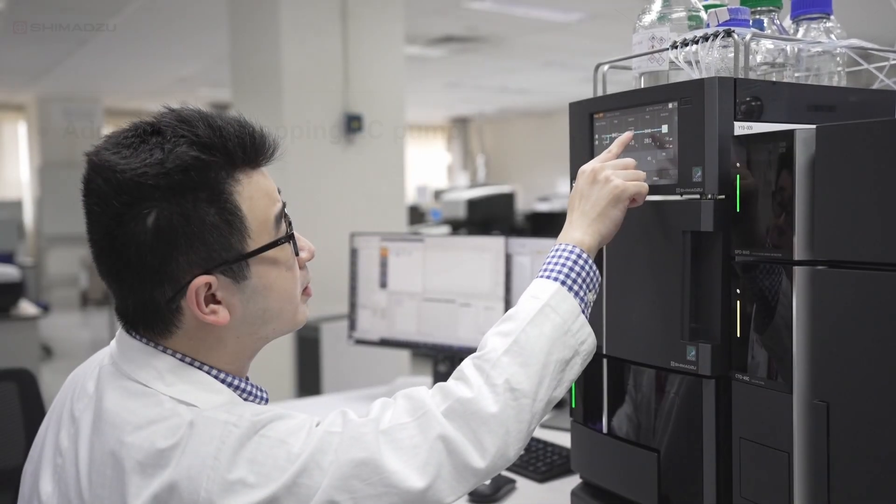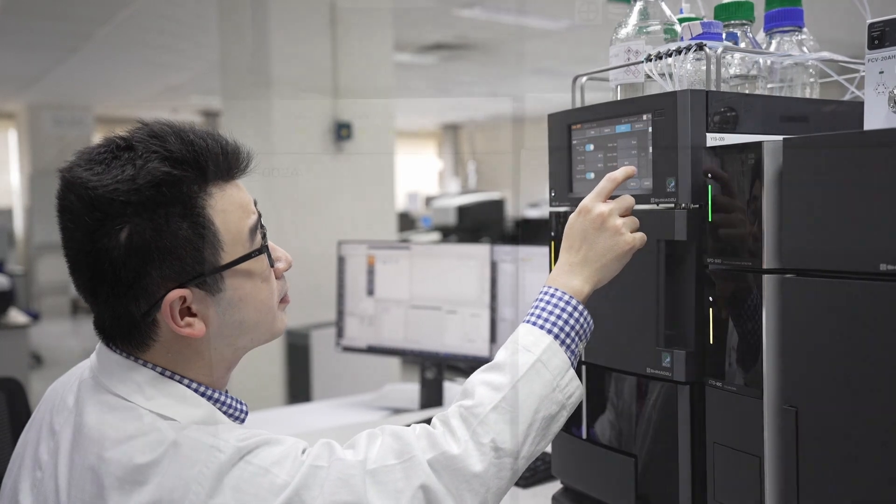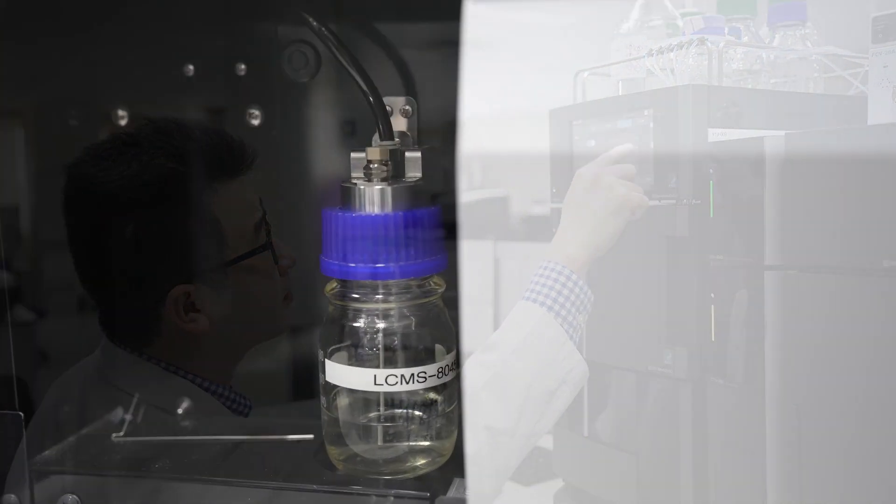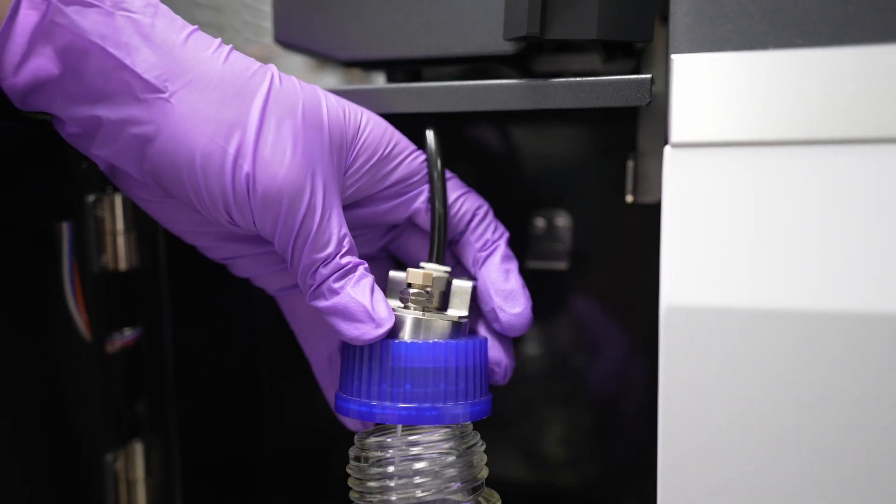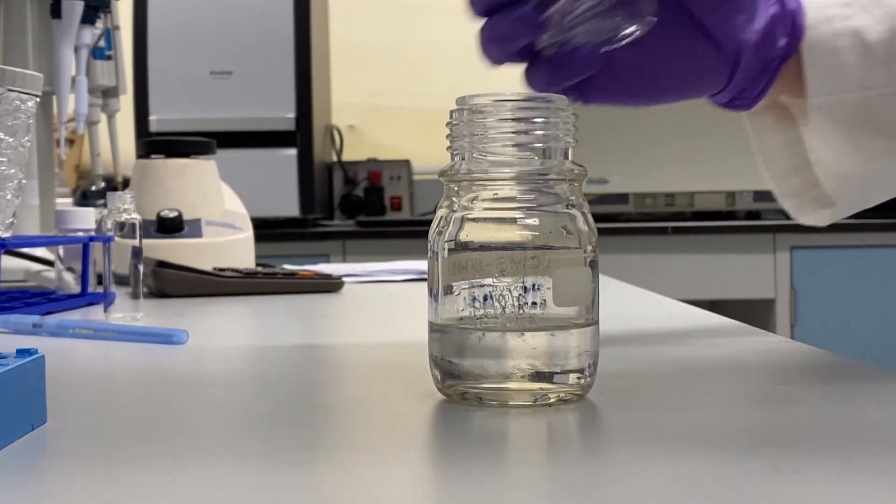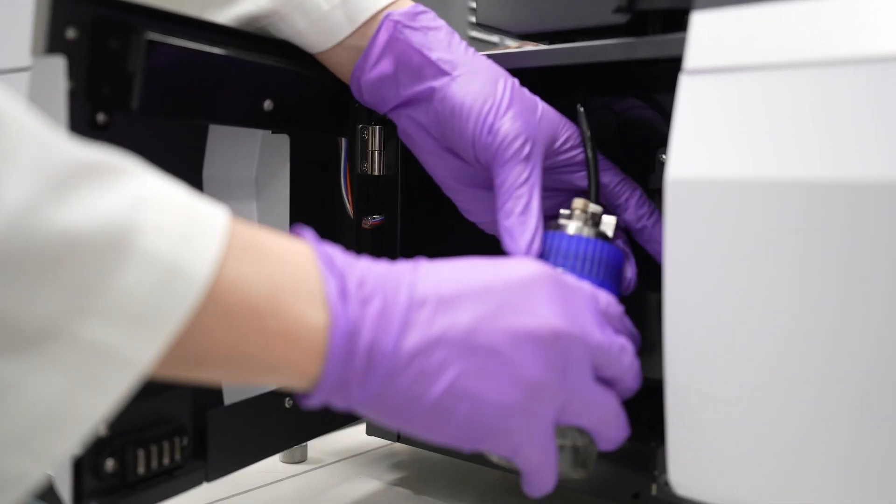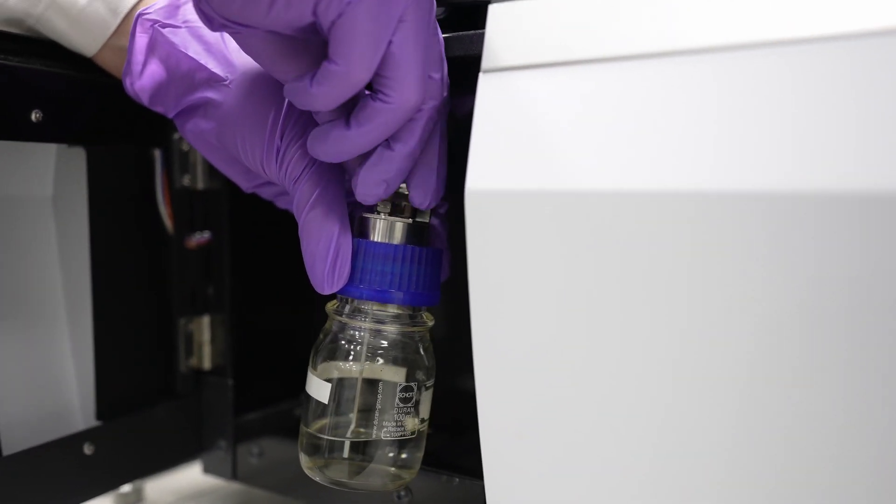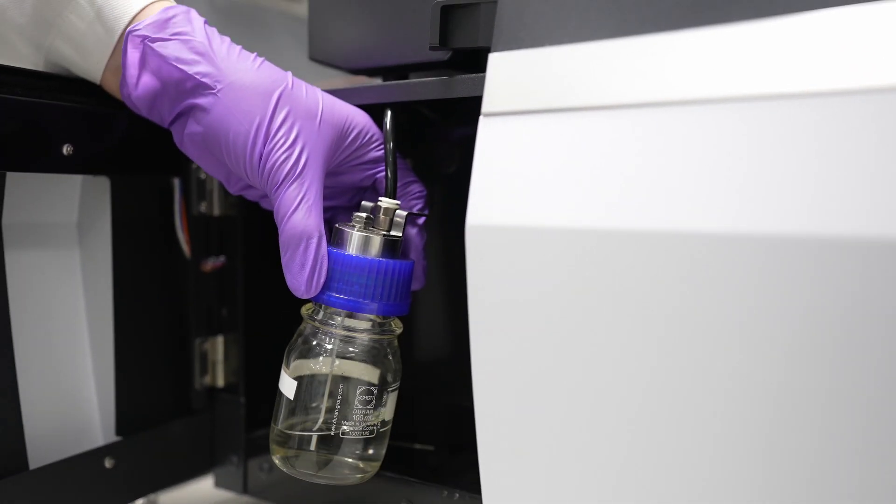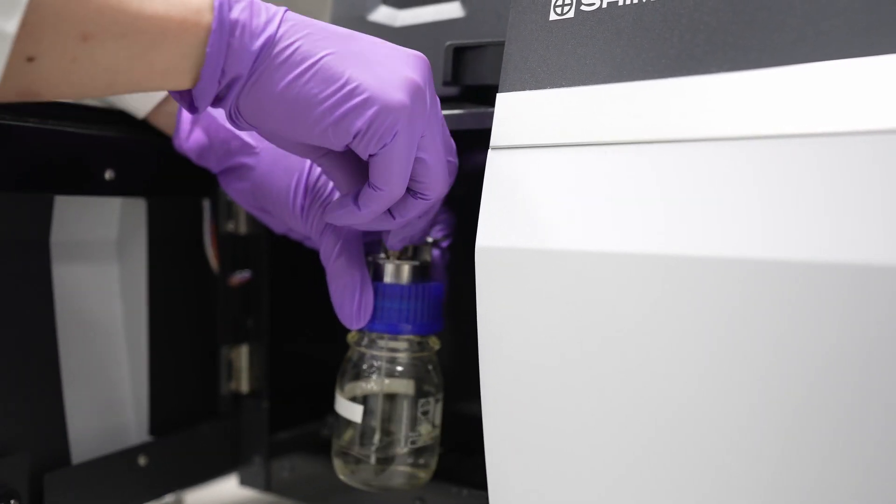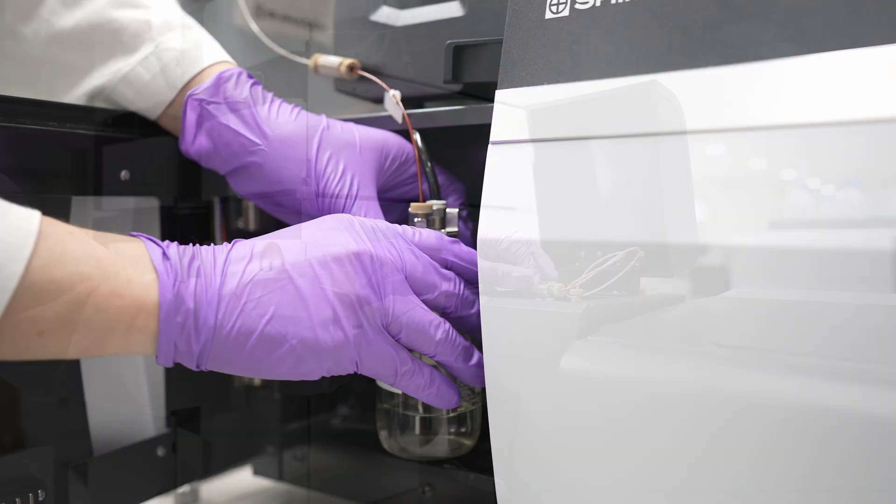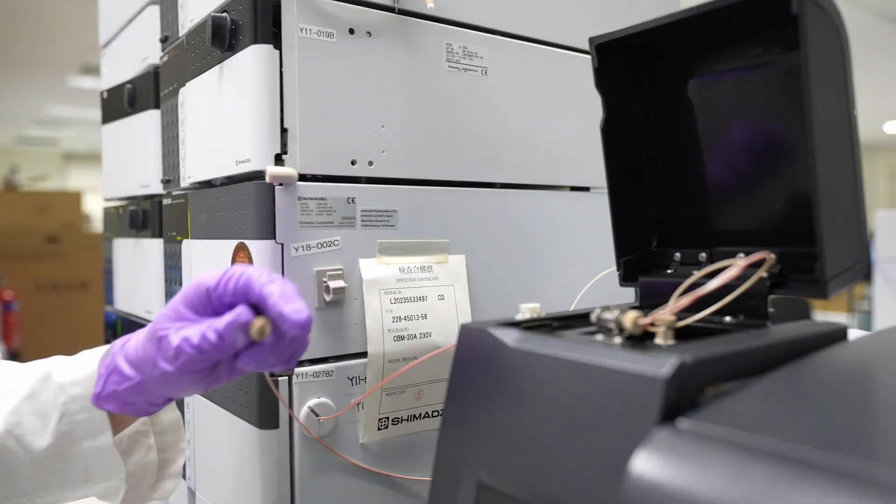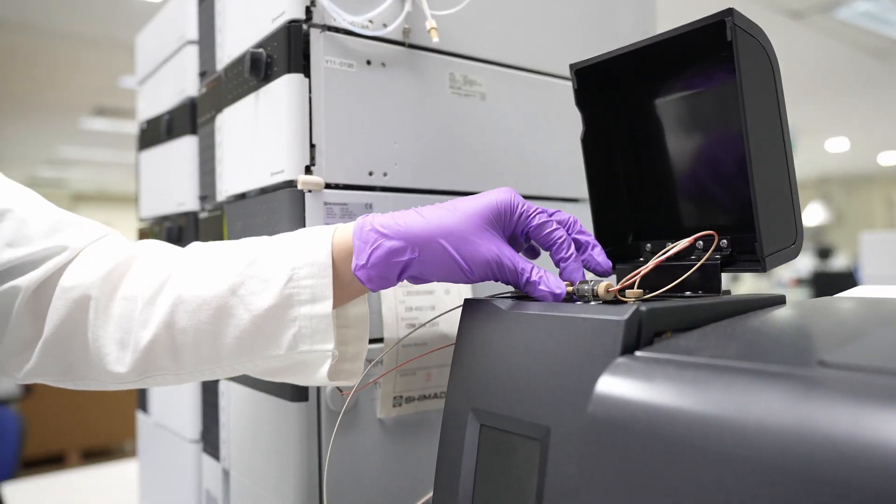First, stop the LC pump. Then, locate the standard sample bottle, uncap and remove the bottle. Next, top up the bottle with standard tune solution. After that, cap back the standard sample bottle, then remove the plug on the standard bottle cap. Subsequently, connect the resistance tubing to the standard sample bottle. Lastly, remove the LC tubing from the ESI probe and connect the other end of resistance tubing to it.